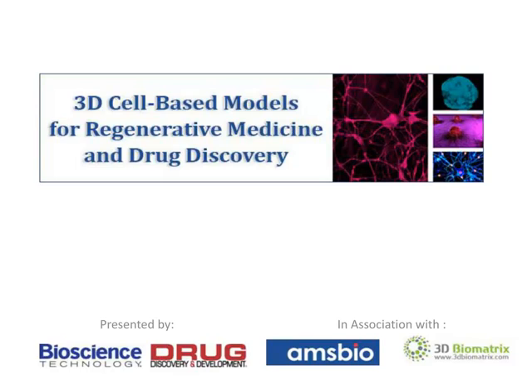Two-dimensional cell cultures provided a number of breakthroughs for understanding human tissues and diseases, as well as for discovering and testing new drugs. However, 2D cell cultures have limitations, such as limited cell-cell and cell-matrix contacts, flat cellular morphologies, and a lack of realistic mass transfer gradients. As a result, technologies that facilitate growing cells in three-dimensional configurations have been developed to make cellular behaviors in vitro better resemble the body. Today, two leading experts in the field will explore the potential of 3D cell-based models for regenerative medicine and drug discovery.